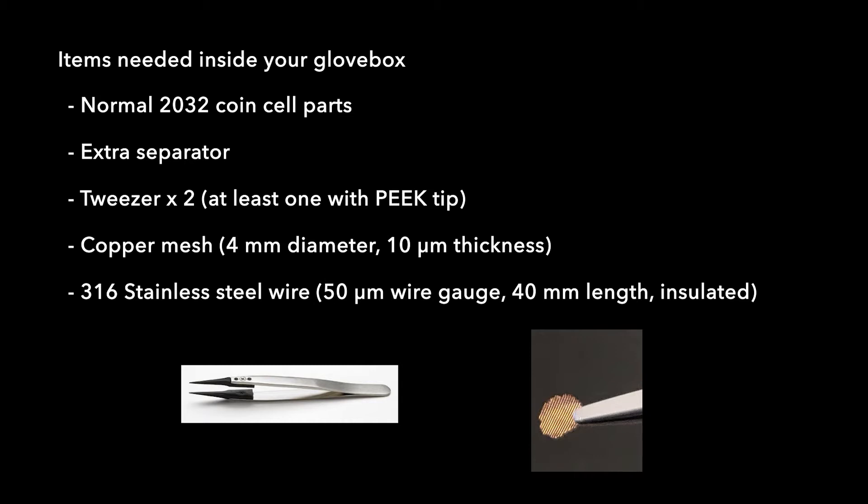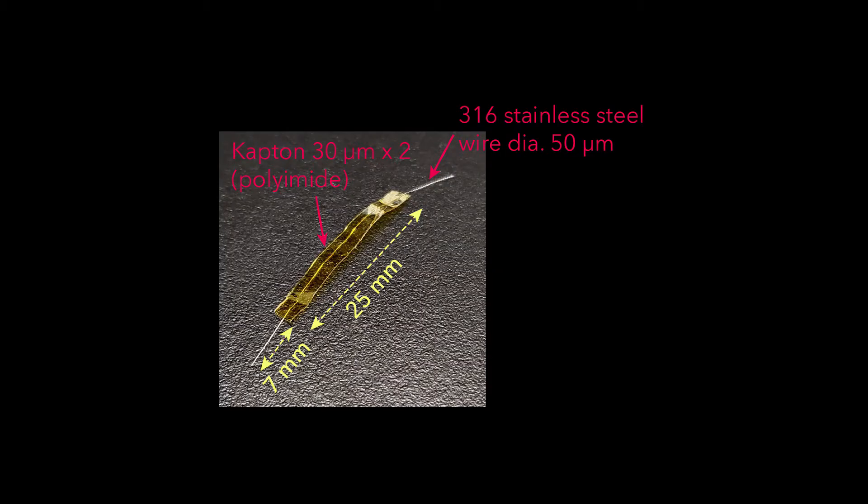You will need a thin wire to make an electrical connection to the copper mesh. Here we are using a thin 316 stainless steel wire of 50 micrometer gauge, but you can also use 25 micrometer wires. We have to insulate this wire. The total length of the wire is about 40 millimeters. The center portion, about 25 millimeters which is about an inch, is insulated with Kapton. Using thinner Kapton tape helps for the seal — here we are using 30 micrometers, which includes the thickness of the PDMS adhesive. You can create a bunch of these, wash them in acetone and alcohol, and then dry them before bringing them into the glove box.